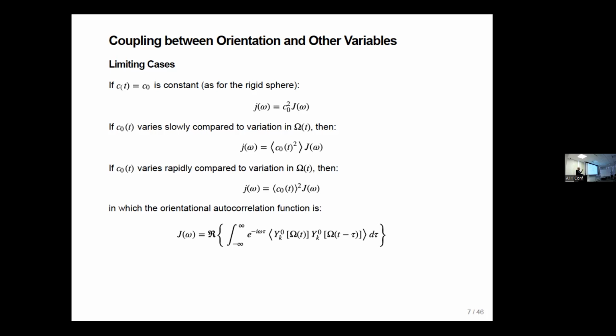The bond is always vibrating, right, on a femtosecond time scale, and that's changing the dipole interaction between the hydrogen and the nitrogen, and there's zero point motion of the hydrogen that's moving it out of plane, etc. So when we use a bond length for these calculations in NMR, that variation is very rapid.